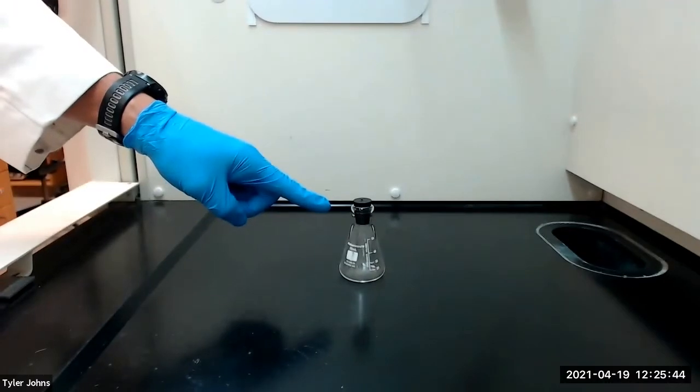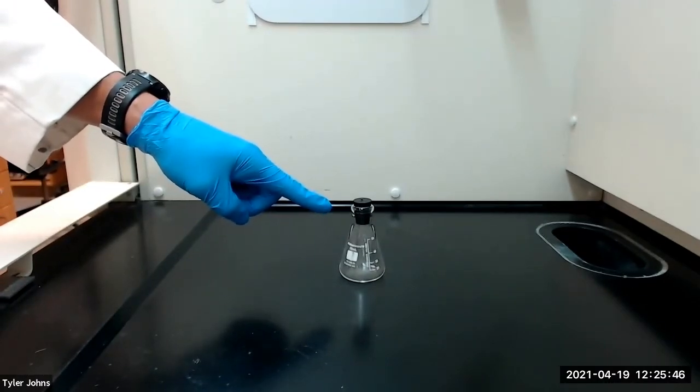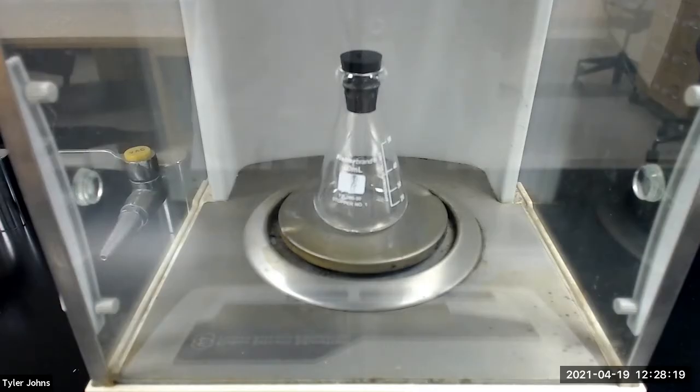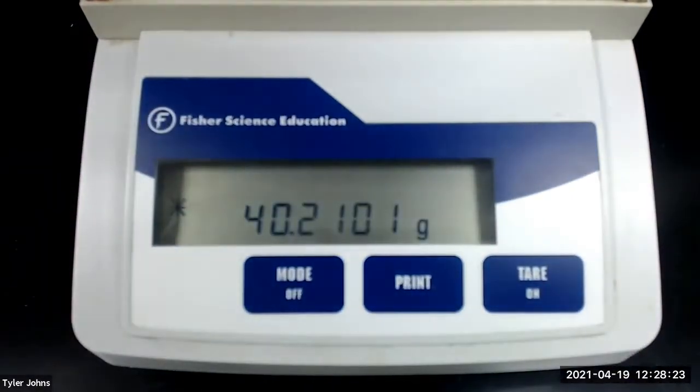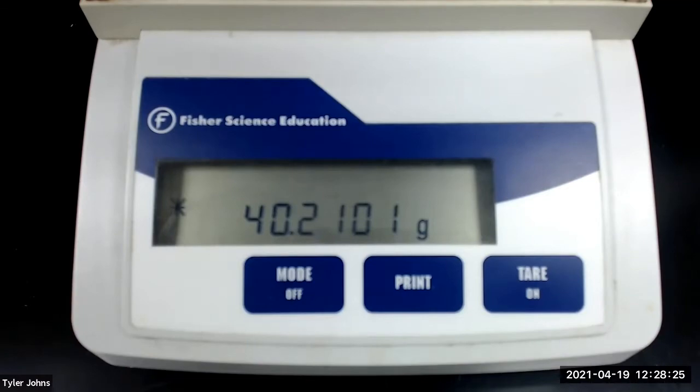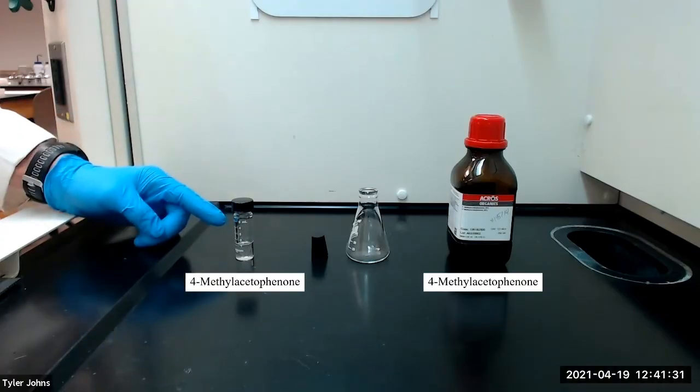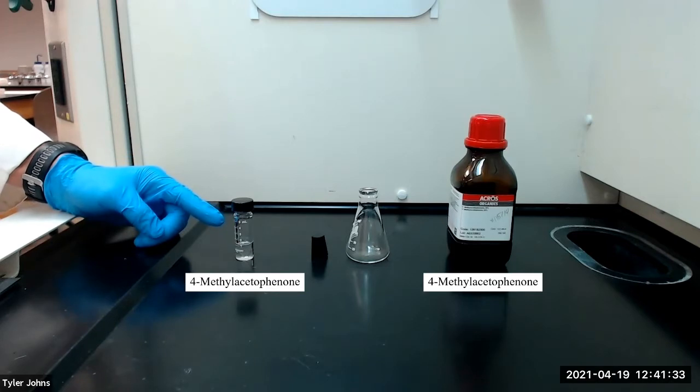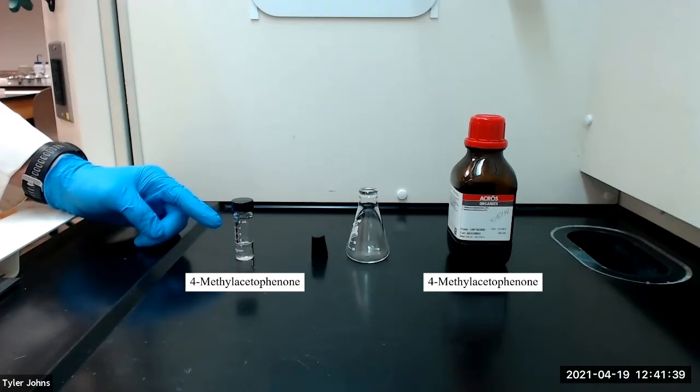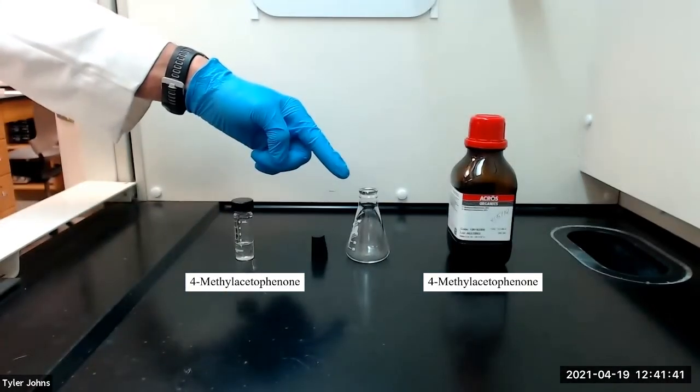Let's get started. To begin, we will pre-weigh a stoppered 50-milliliter Erlenmeyer flask. The mass of the pre-weighed stoppered flask is 40.2101 grams. We next need to add approximately 0.005 moles of the 4-methyl acetophenone product from the Friedel-Crafts acylation experiment to the pre-weighed Erlenmeyer flask.